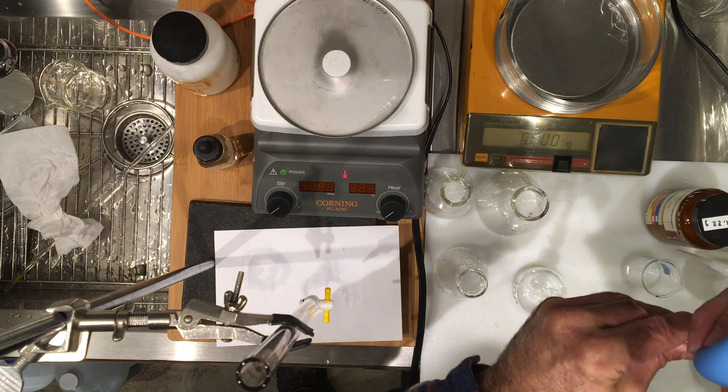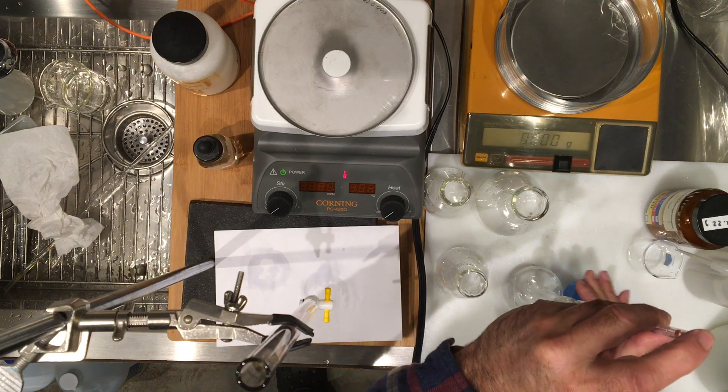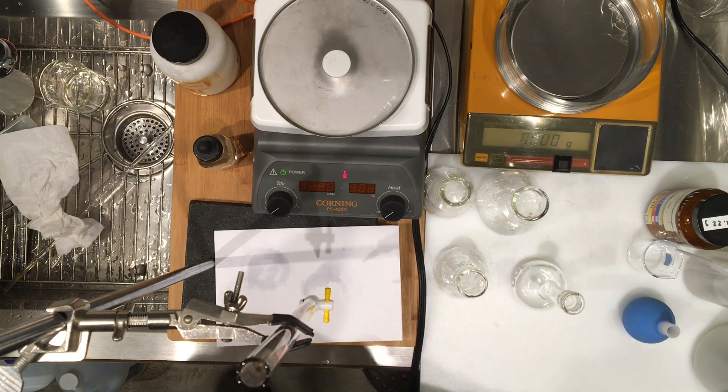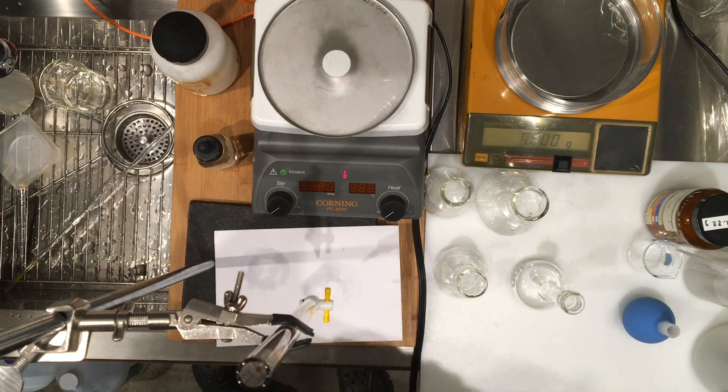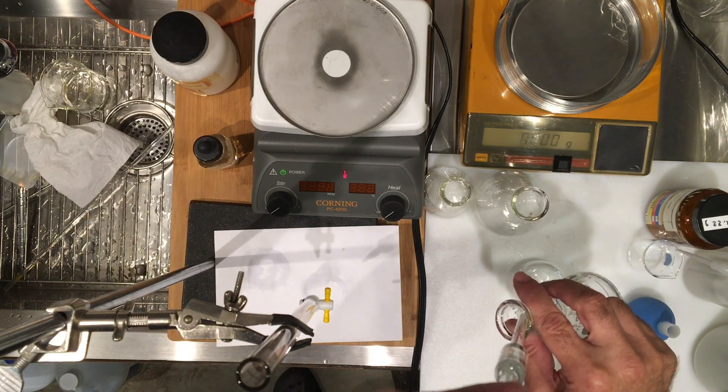My pipette is already clean, rinsed, and conditioned with the solution. I'm going to bring it to eye level and make sure that I have the meniscus exactly lined up with the 10 milliliter line, and then I'm going to get any hanging drops out and transfer the 10 mL into the flask.